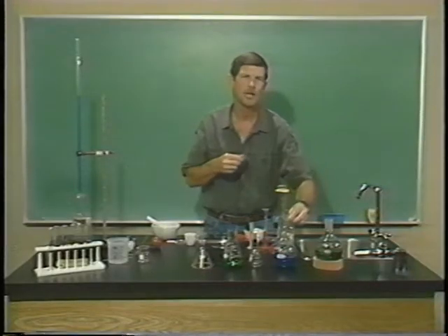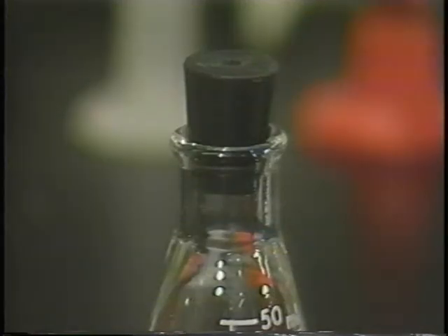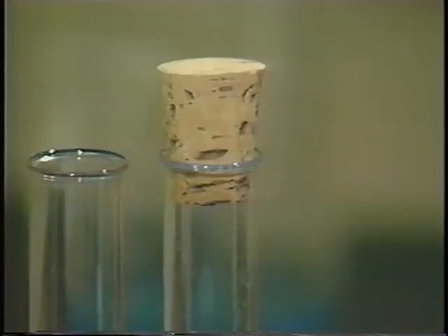We also have other types of stoppers too. In this Erlenmeyer flask, we have a stopper made out of rubber, called a rubber stopper. Then if we have one made out of cork, it's not called a stopper anymore, but rather a cork. Then we have the instrument that we use to measure liquid volume, the amount of space that a liquid takes up. It's called a graduated cylinder.